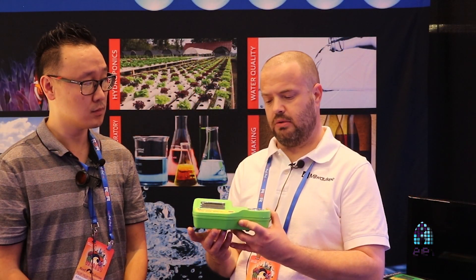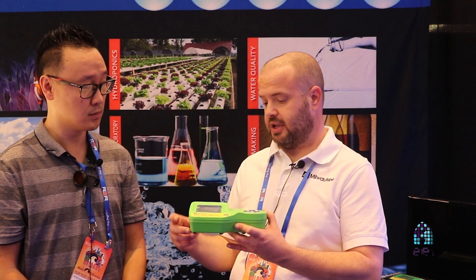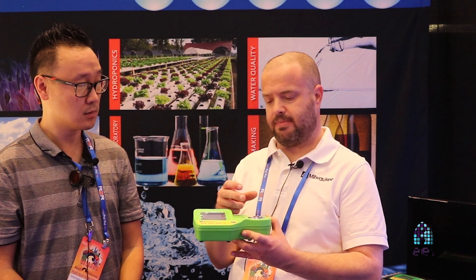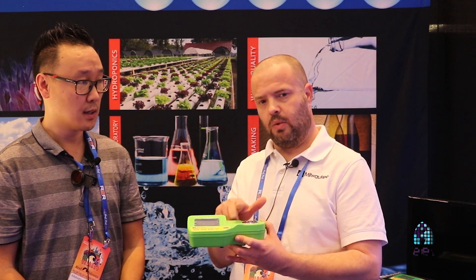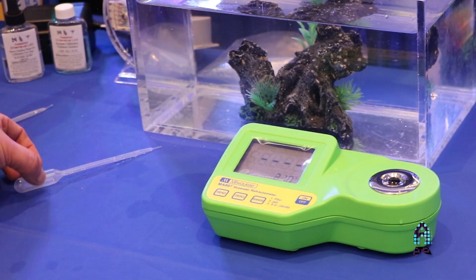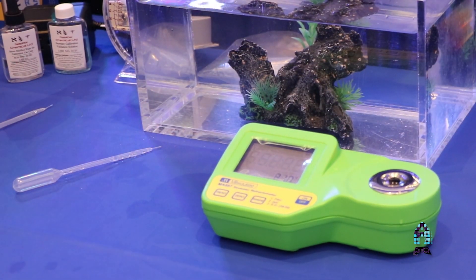And how does this unit work? Turn the unit on, and only use distilled water to zero it out. You've got a zero button right here in the middle. So you put your distilled water sample up here, zero it out, wipe the prism, and then simply apply your aquatic water up here and hit the read button — that's all there is to it.